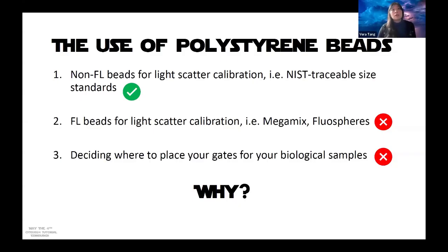Other situations where people are asking about fluorescent bead mixes, namely, there have been some popular products such as Megamix. Fluorophores we also use, but we don't use them for calibration. We cannot utilize fluorescent beads for light scatter calibration, because the fluorescence will also interact with light, and these are also not NIST traceable. So the sizing of these beads is not super accurate.